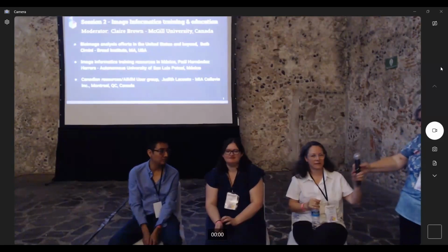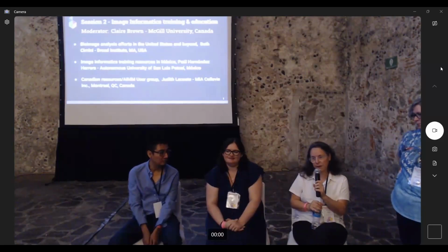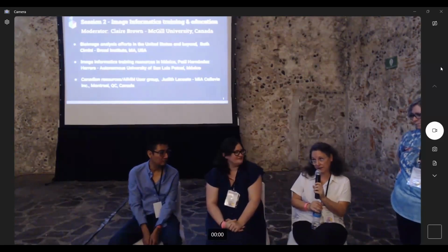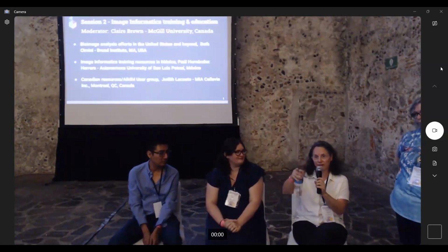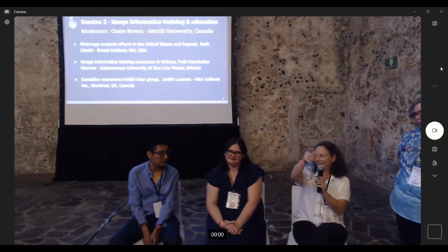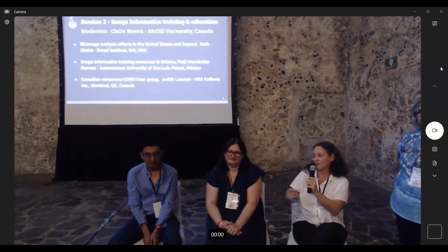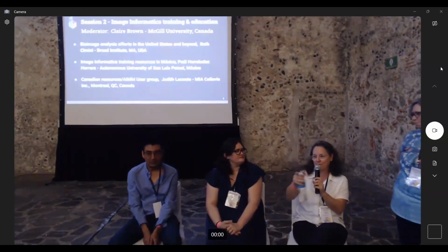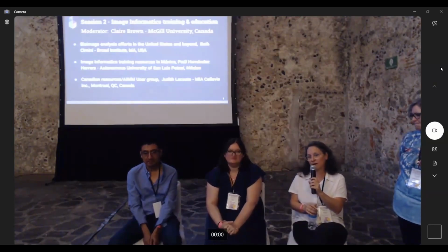It's a great idea. I have another idea that extends that. We know that Microscopy DB is a great resource, and maybe we could present Microscopy DB as matching the REMBI models. Like, this is a resource for metadata annotation for the experiment, this is a resource for analysis, this is a resource for the microscope. So maybe we could visually map Microscopy DB with the REMBI cycle.